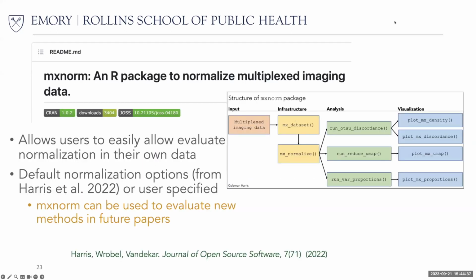Sorry for interrupting. I have a question about normalization. You mentioned that it is helpful to normalize within an image, but what if we have different slides and we try to normalize one channel across different slides, not within an image? Would that be helpful to get rid of the artifact effects, or use one threshold for the whole set of slides that we have, for example?